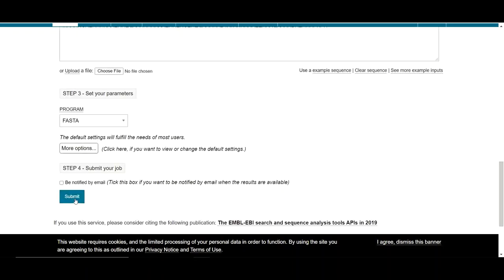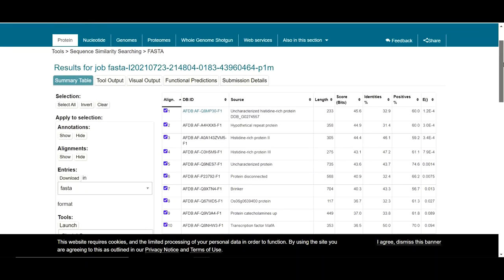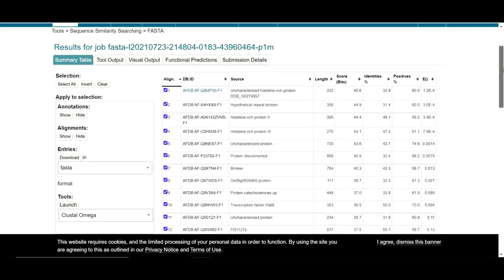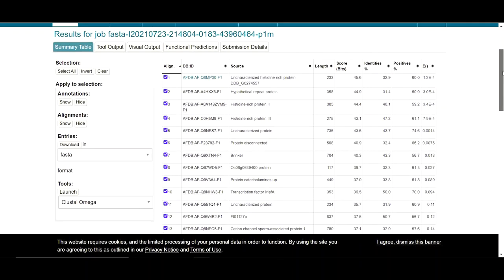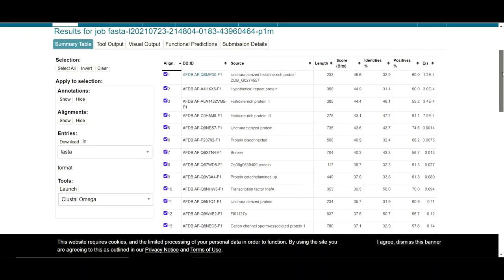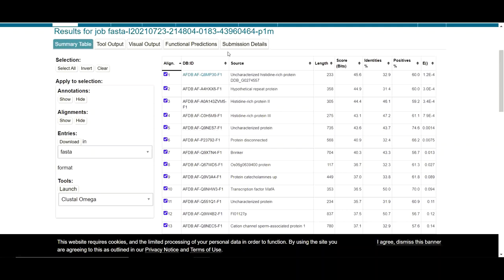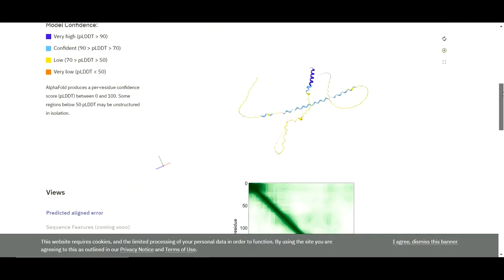When you click on the submit button, after a few moments you will have the result page. And here on this result page, you are going to have all of those structures which are similar to your protein sequence which you have submitted previously. Now you need to click here to get access to the protein structure which is predicted by AlphaFold. So when you click here, after a few moments you will have your protein structure.